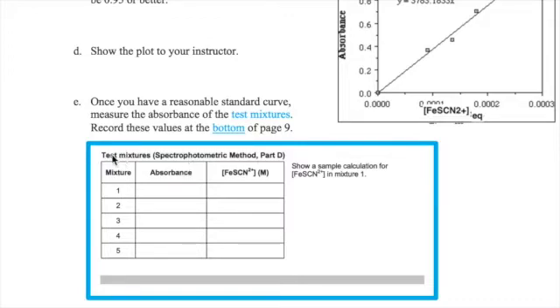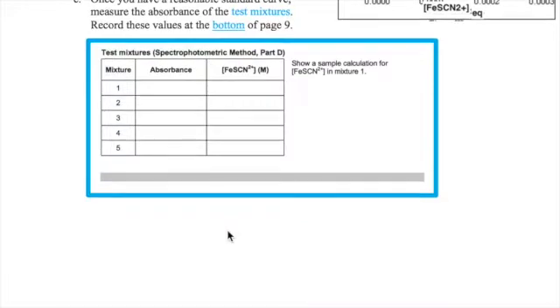The table has the title test mixtures. If you have time, use the epsilon value that you get from your standard curve to calculate the concentration of the complex ion in your test mixtures. Check your data with your instructor. That's the end of the experiment.